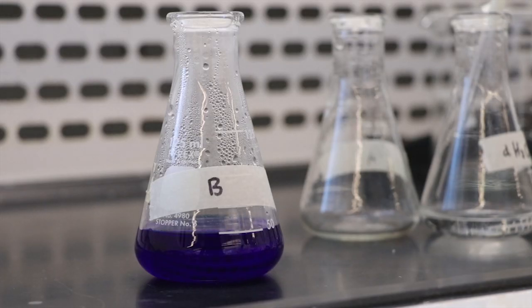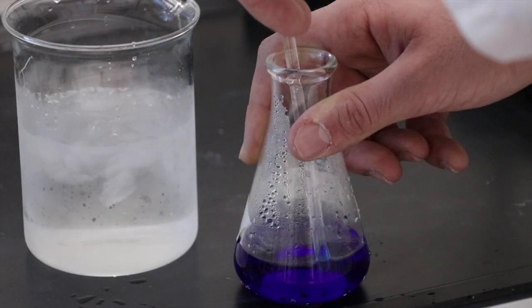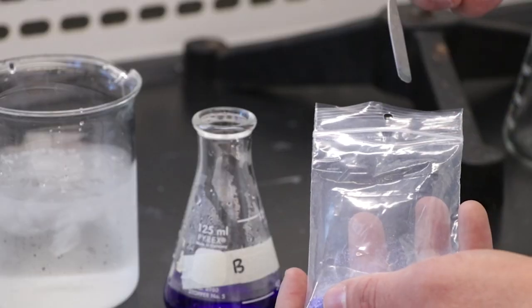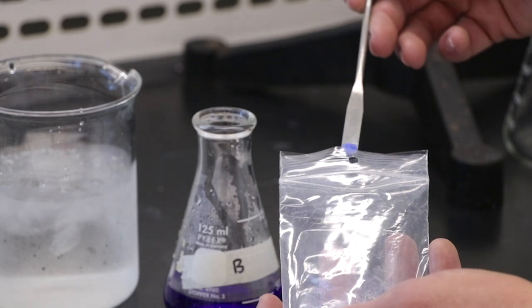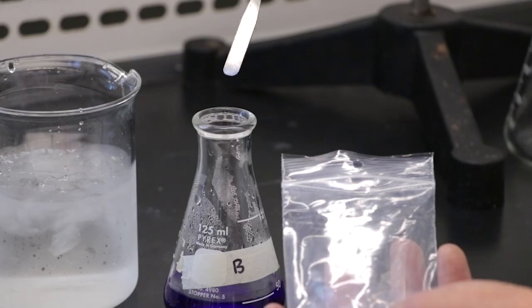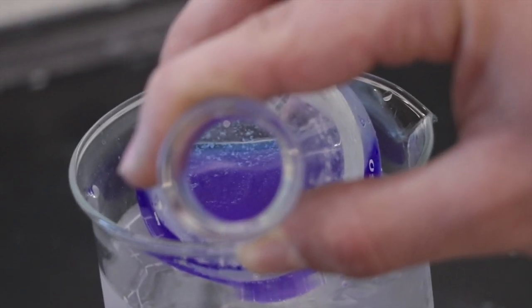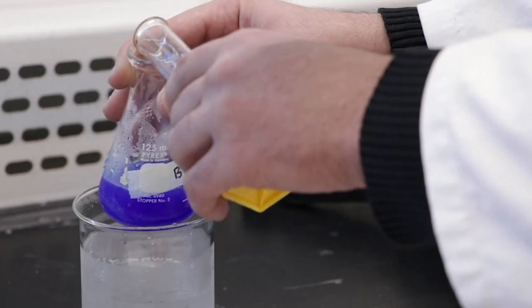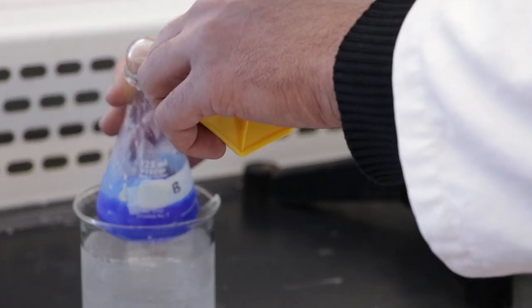If the product is not precipitating out, you can use two techniques designed to encourage precipitation. First, try scratching the inside of the flask with a glass rod in an up and down motion at the air-liquid interface. If scratching does not work, obtain a small amount of crystals of the product from your TA and add it to your solution. These seed crystals act as a template on which the dissolved product will begin to precipitate out of solution. Upon crystal formation, add 20 mL of acetone or ethanol with continuous stirring and then allow it to cool for several more minutes in the ice bath.